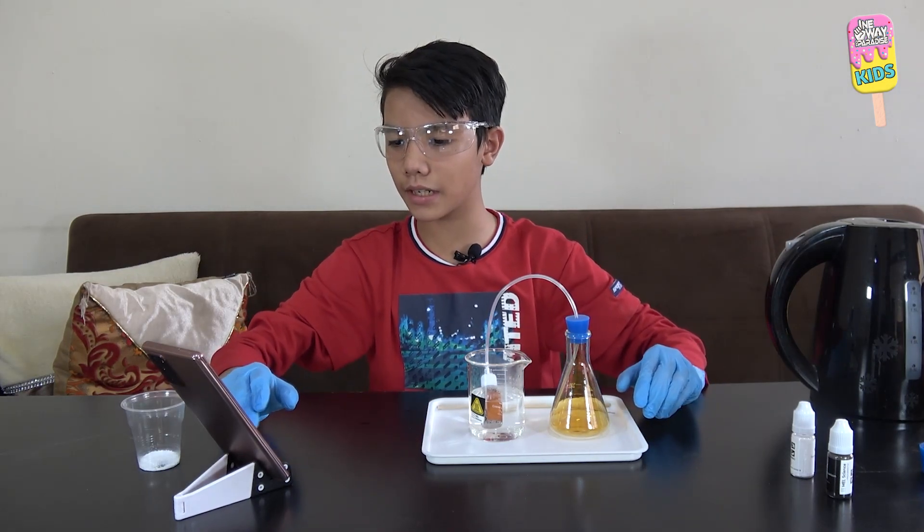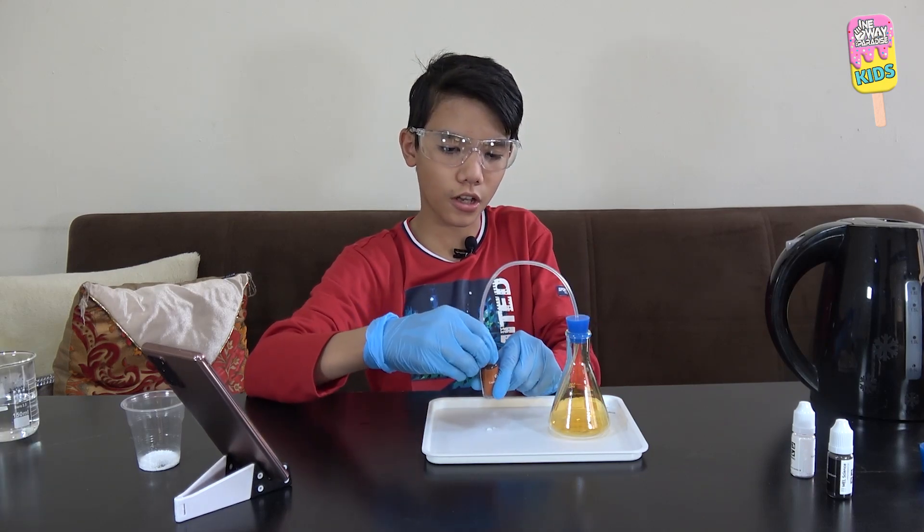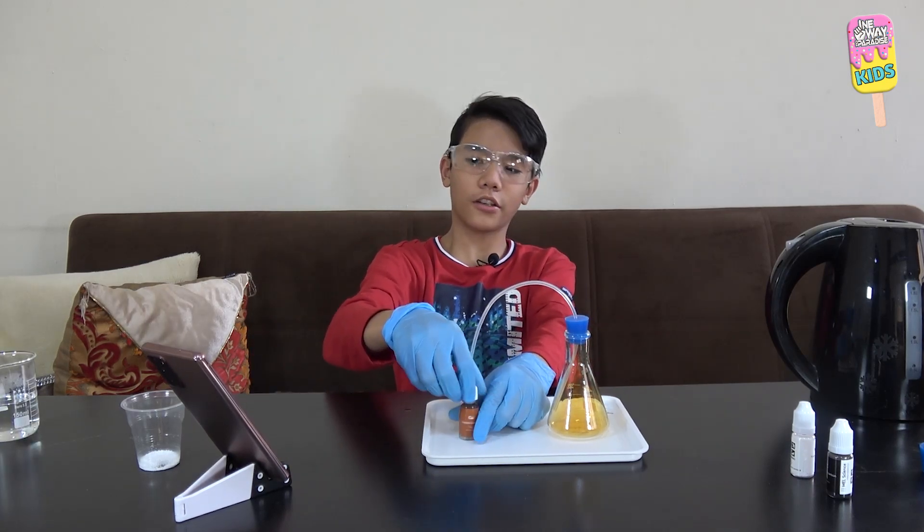Okay, I'm back. It has been 10 minutes. And now I'll take the bottle out of the hot water. Now we'll remove the nozzle — I don't want to inhale this.